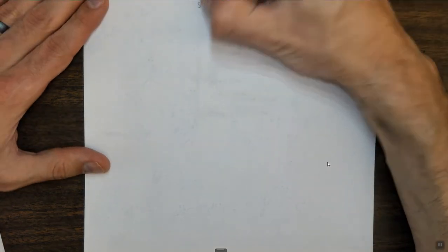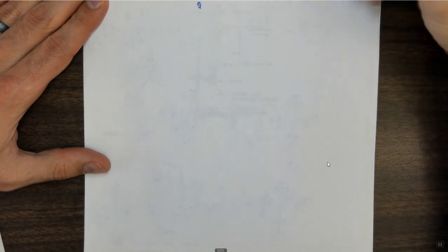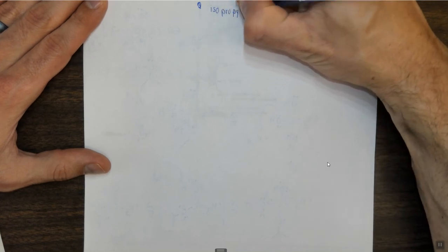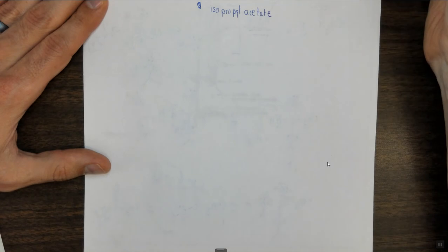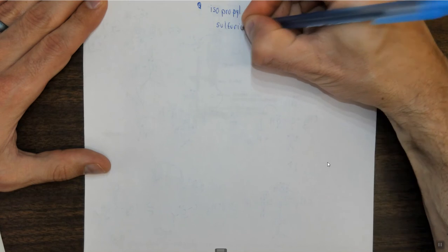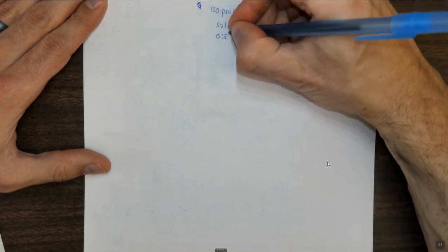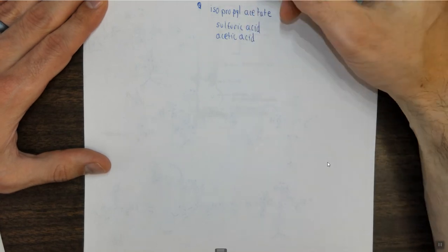So what are we starting with in the reaction mixture? Well, we're going to have in the reaction mixture our product, because the separation is separating our product from everything else. Our product in this case is isopropyl acetate. What else are we going to have in there? Well, we're going to have sulfuric acid, because we used that. We're going to have acetic acid, because the limiting reagent is going to be the isopropanol.